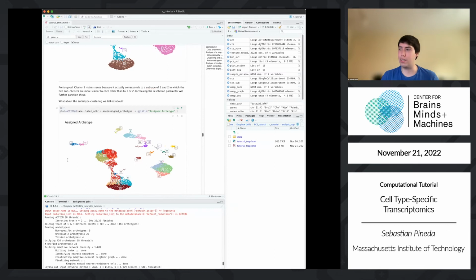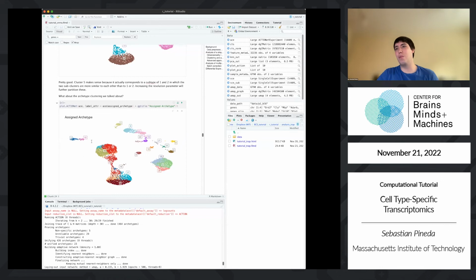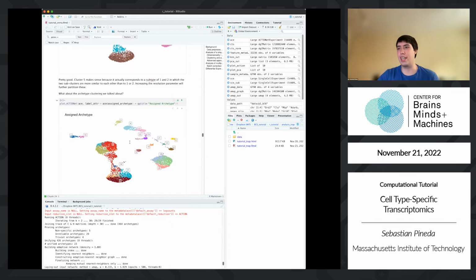So there are many different clustering algorithms out there, and the best way to use them is by using several of them, because they all identify different things. There are algorithms like Louvain, HDBSCAN, and they all identify different things in your data. And they're very useful for cleaning the data, identifying cell types, or finding interesting pathways that are being activated in some cell state. So when we do the analysis and the data curation, we apply a lot of these algorithms because they're good at identifying a lot of things. And the better and more informative your underlying graph structure is, the better you can define the relationship between different cell types, and the better these things work.